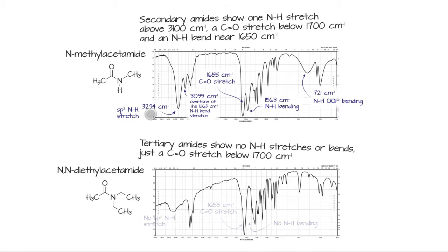Now things get a little more difficult to interpret when you're talking about tri-substituted amides because there is no clear NH stretch here to sort of say, hey, there's an amine present. All we have is a low carbonyl stretching frequency. But of course you'll know that there's a nitrogen in there from mass spec. So when you see the low frequency, I would start to suspect that that carbonyl has an amide on it. Hopefully some NMR will be there to really shore things up for you.